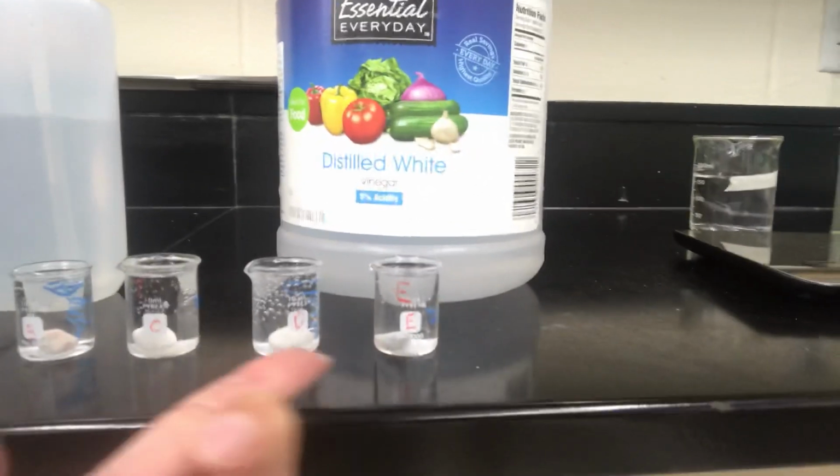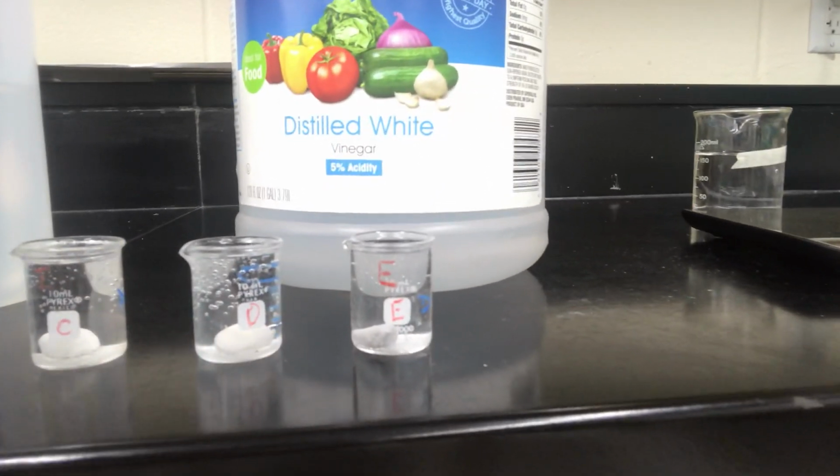So I don't know if you can see it on the video or not very well, but there are some bubbles coming up from these beakers, from the rocks. So what do you think might happen? Well, what your first period classmates did is they took each marble or each rock, and they found the mass in grams before they put it in there, and we're making some predictions about what we think we'll see tomorrow.